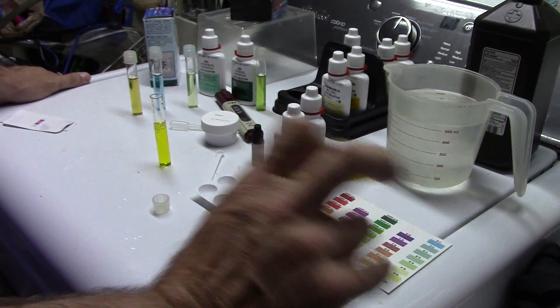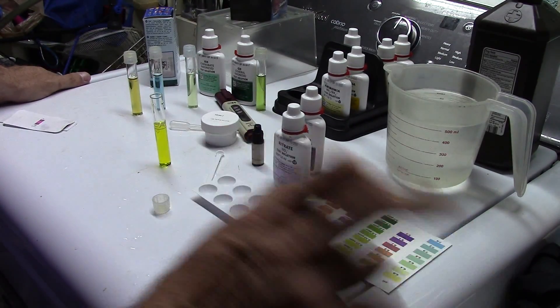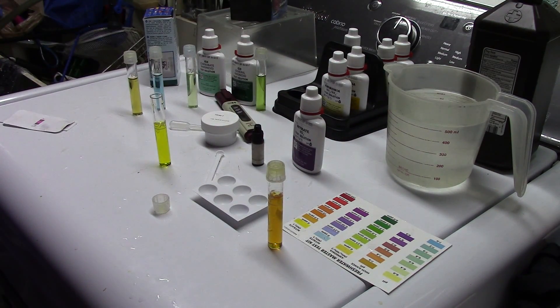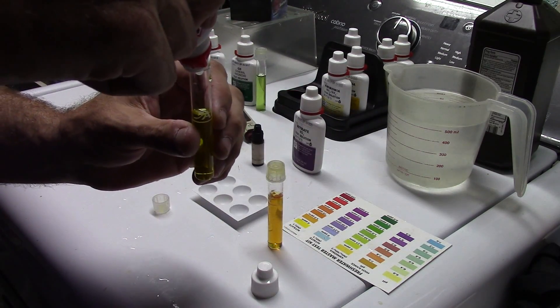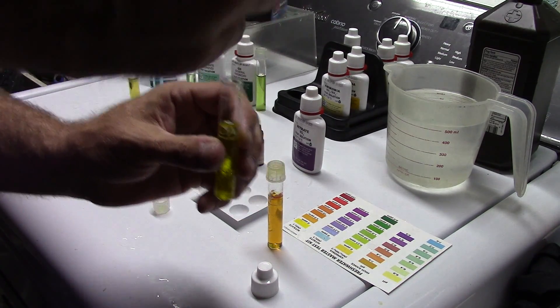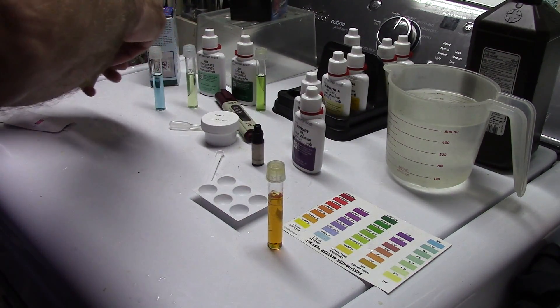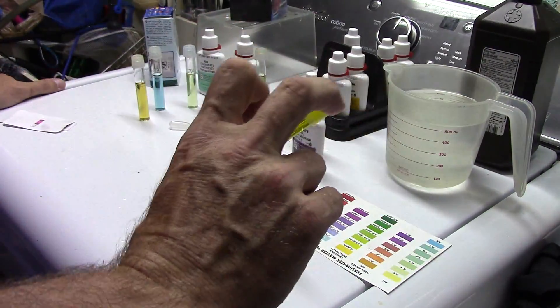Whenever I bring water home from the fish store I always like to check the water. That is one minute of vigorous shaking. Now we will do the same test — even though it's only been one minute I still feel it necessary to give another thorough shake to the second test bottle of nitrate solution. This vial — we are going to do this for one minute and see if it makes any difference.